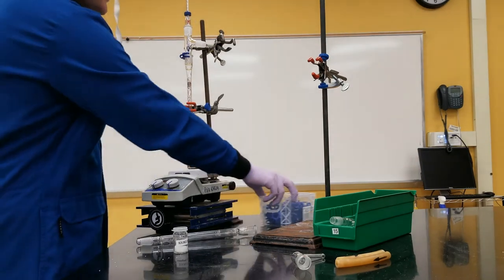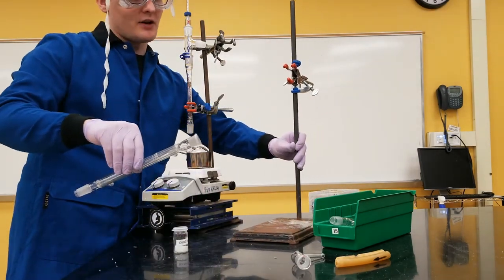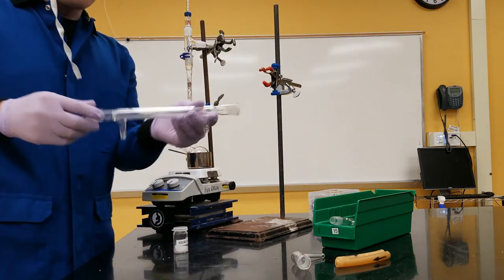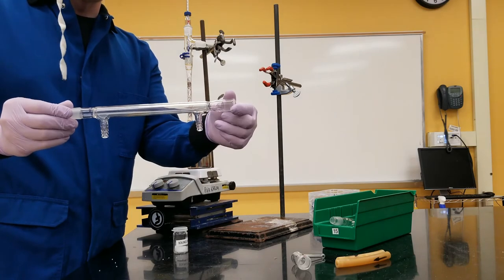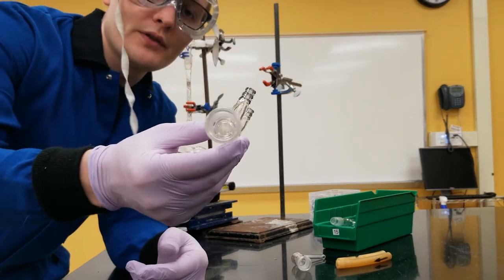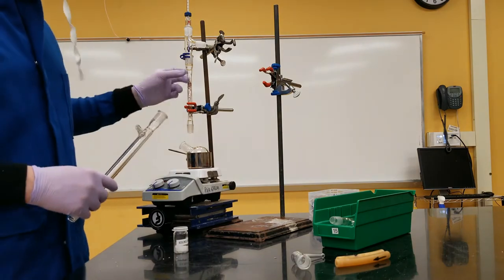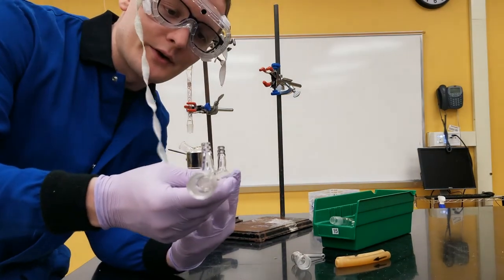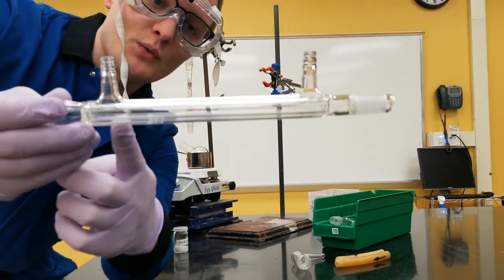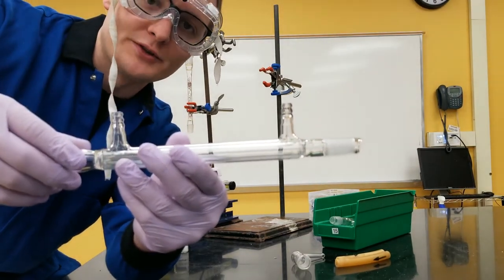So the next thing that I'm going to add is my means of collecting the solvent as it escapes. And for this, I'm going to use a water jacketed condenser. Now, this is a tube in a tube. So there is a central tube, which is very similar to just a glass pipe, just like any other. And around that, there is a jacket, which is a tube that runs water over that central tube.